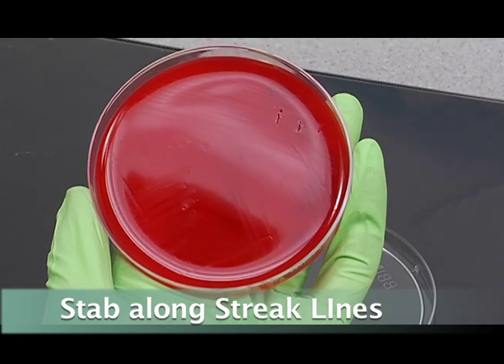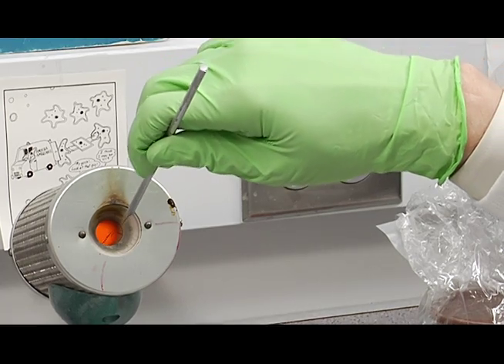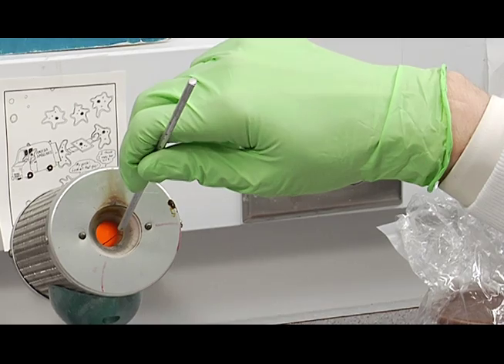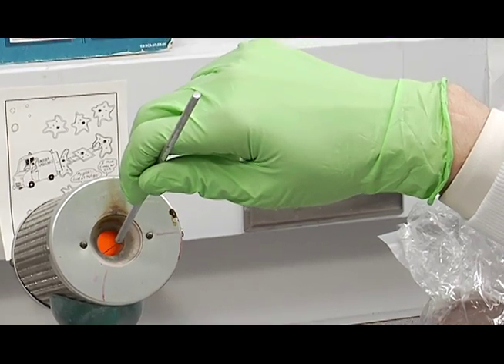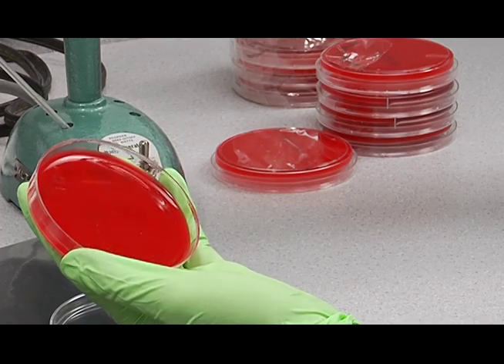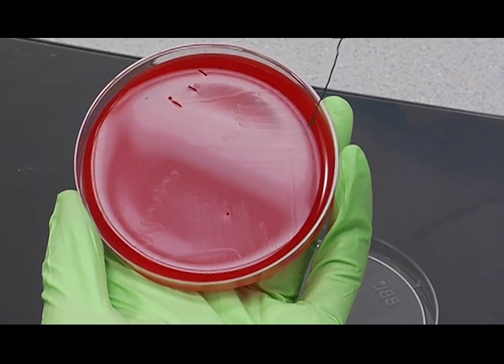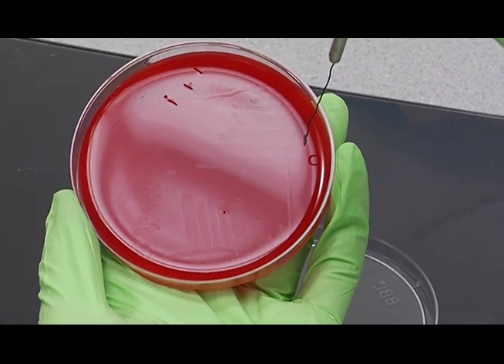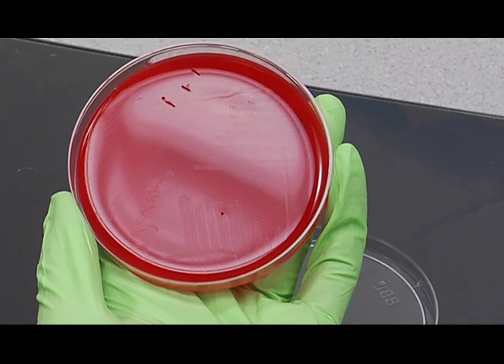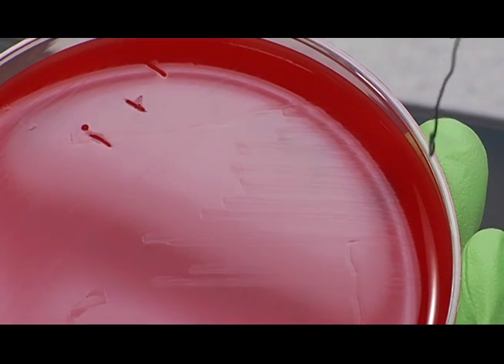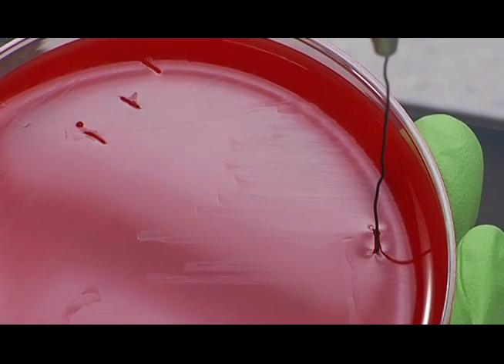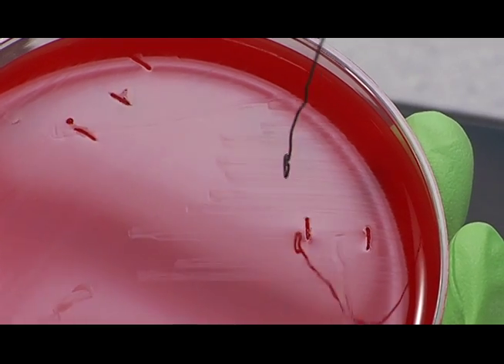Then you're going to flame the loop again. And we'll make three stabs in the end of this area right here. And stab right here, right here, and right here.